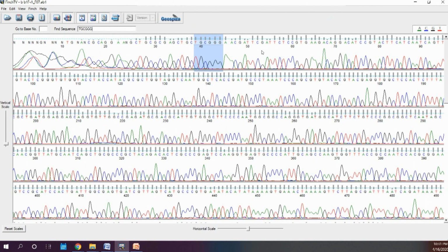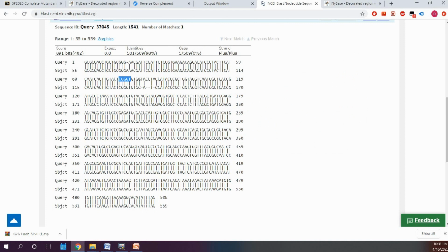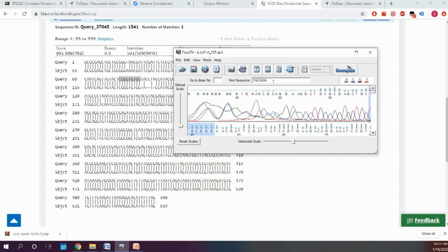And the way that you would explain this is that, one, there's this really large peak that doesn't look right, two, there's a large gap here, and three, the bars in this region are low, which means the sequencing confidence in this region is low. So that's probably not a mutation, that's probably just an artifact of the sequencing. So let's try it for the next couple ones. Let's copy this. Let's paste that in here.